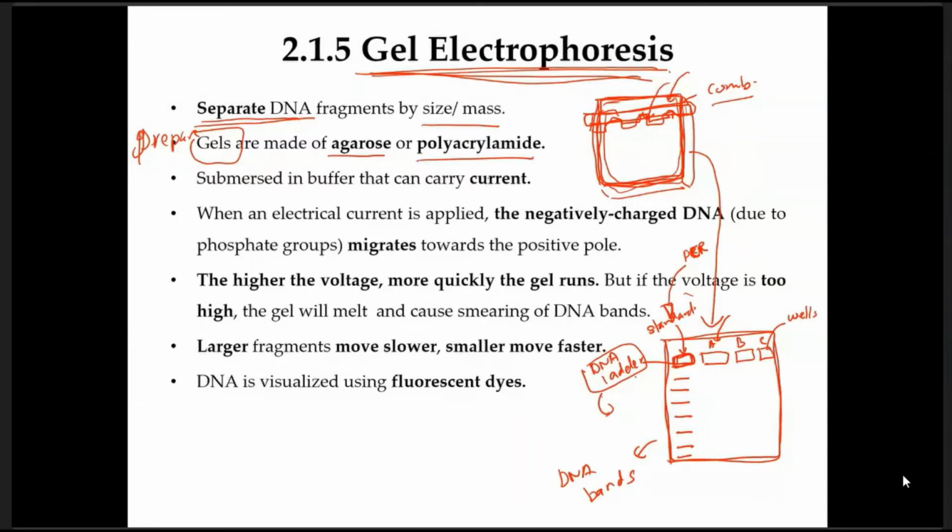So maybe sample A, dia akan bagi bacaan DNA dia kat sini satu, kat sini satu, kat sini satu. B, sini dengan sini. C, sini, sini, sini. Macam tu kan. So this is the DNA band for sample A, for sample B, for sample C, you have to compare with the DNA ladder so that you know the size of the DNA. Ini dia bagi tahu size sahaja.